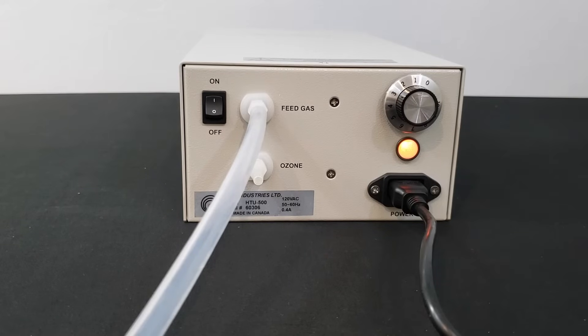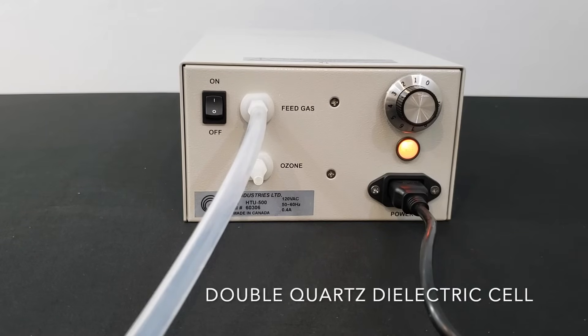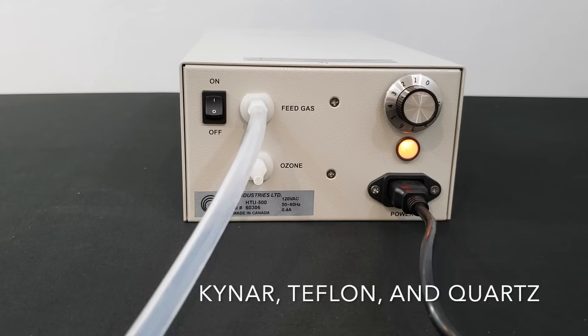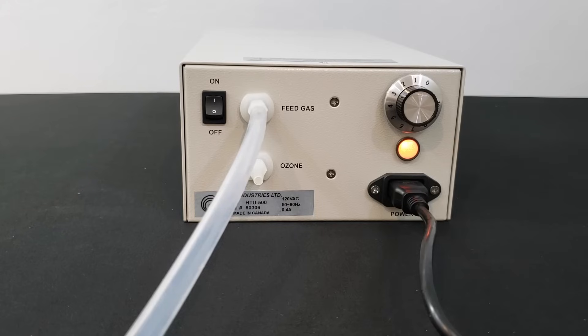As the feed gas flows through an internal double-quartz dielectric cell, pure ozone is produced. One of the greatest things about this model is that the oxygen and ozone gases only touch Kynar, Teflon, and quartz — never metal. This makes the life of the device much longer.